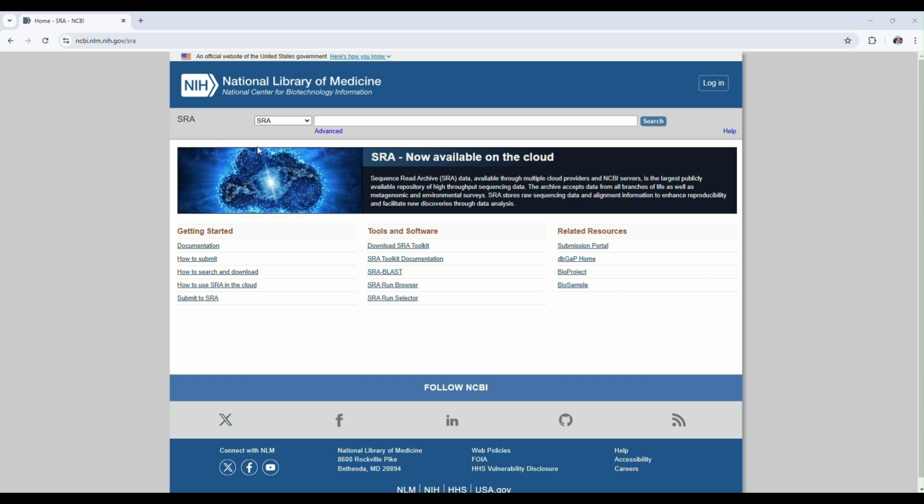Why is this useful? If you're studying disease, evolution, or any genetic-related topic, you might need real data for your work. You know the size of NGS raw sequencing data is very huge. Now assume that you need multiple of them for your work. Therefore, it's very hard to download and convert them manually. Here, SRA Toolkit will help us. By that, you can easily download multiple data and convert them into a format like FASTQ and analyze easily.